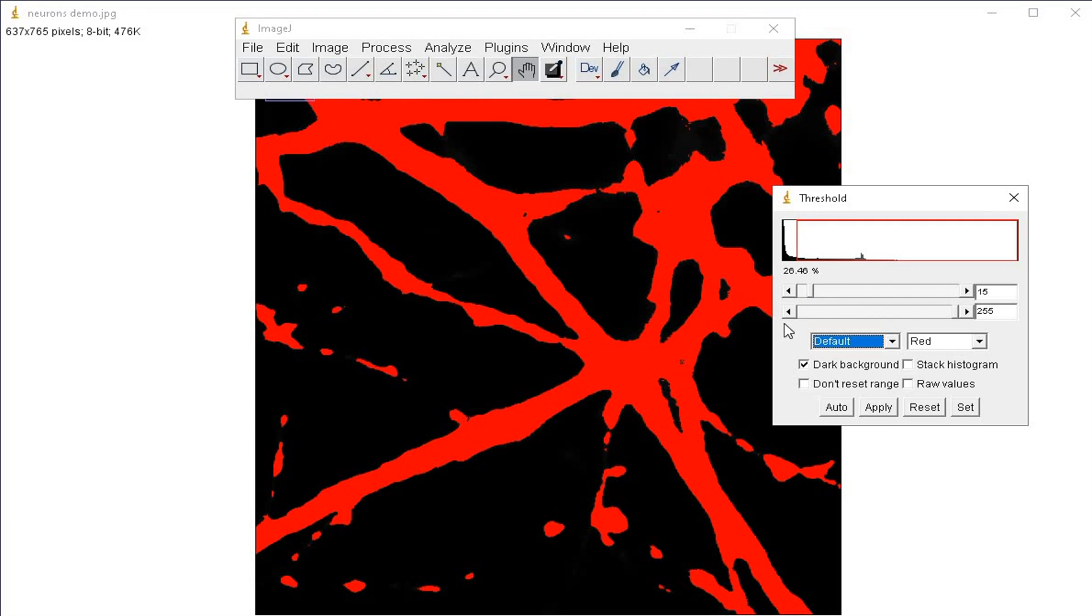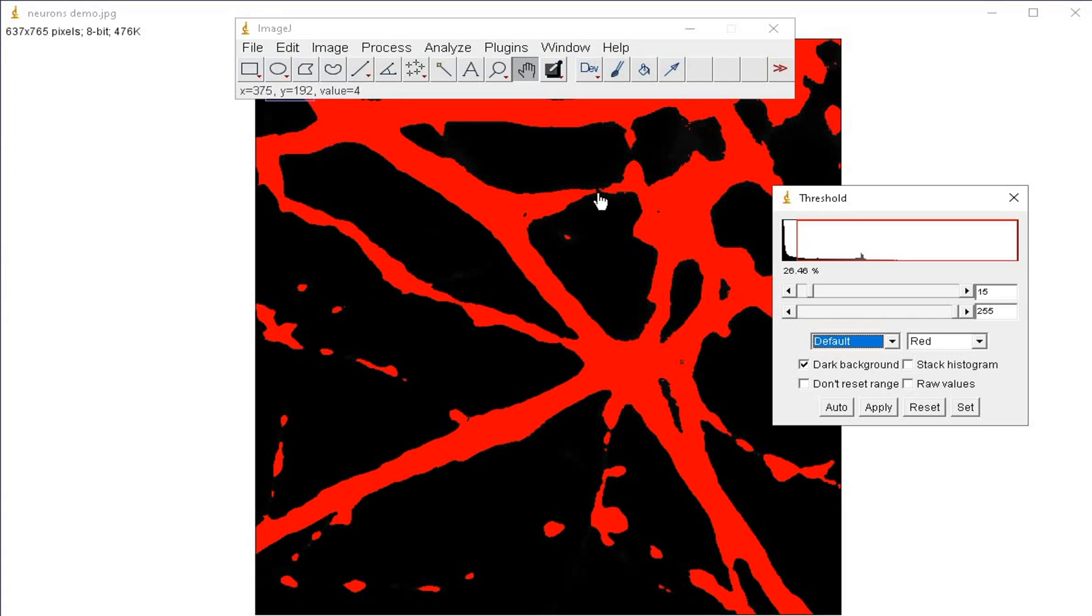Now these branches are connected to one another. Sometimes the gaps may not be connected even after adjusting the slider.